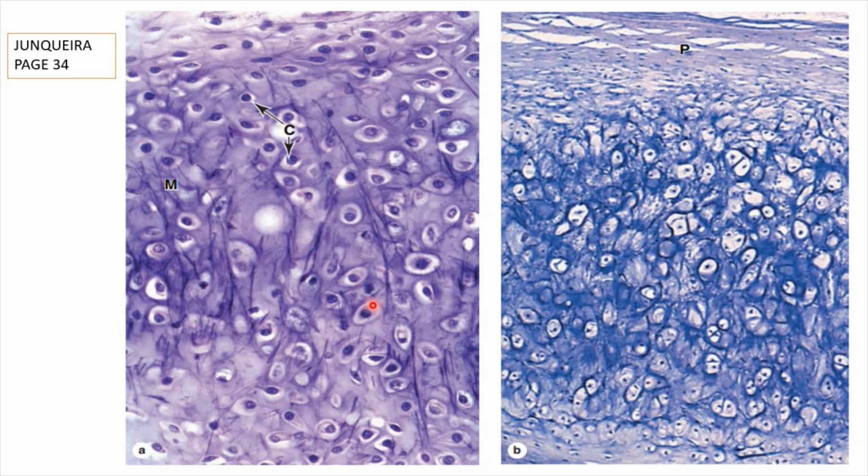So the chondrocytes are mostly single in each lacunae. Lacunae, one chondrocyte. Lacunae, one chondrocyte. This C here just tells us that this is a chondrocyte. Okay. All right. Now let's go on.